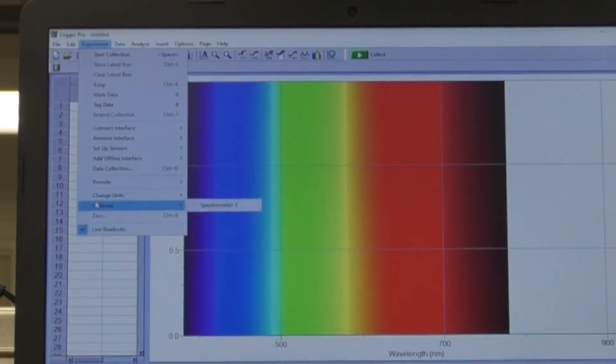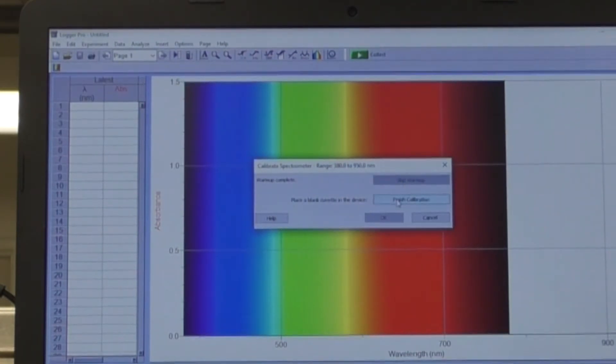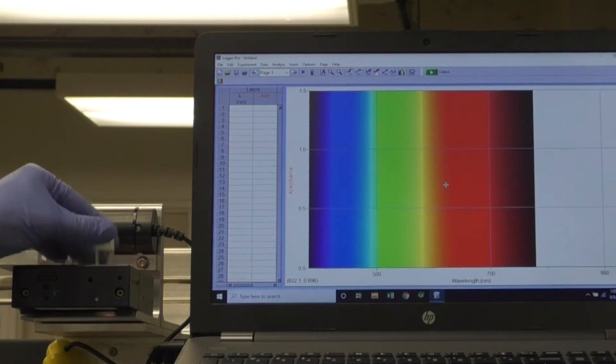Choose Experiment, Calibrate Spectrometer 1. If the spectrometer has been on, you can choose Skip Warm Up. Click Finish Calibration, then OK or Done. Place the blank back in the patient block.